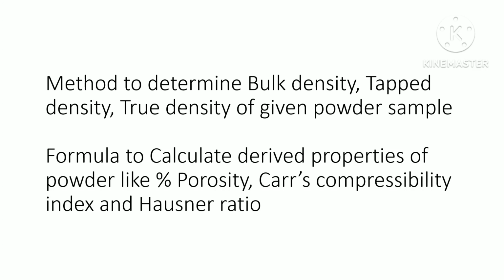So we will discuss the concept and method to determine bulk density, tap density, and true density of a given powder sample, then the formulas to calculate derived properties of powder like percent porosity, Carr's compressibility index, and Hausner ratio. Now let us begin with the basics.